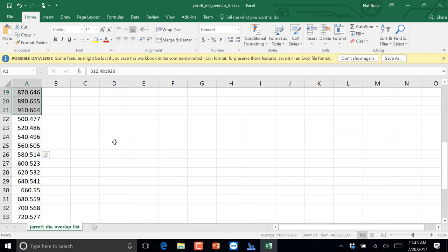One key thing when you're doing these overlapping approaches is to make sure that you don't sort the isolation window list, because then it's actually not going to work. That's a very common problem, because when you've done that, you could still demultiplex the data, but you've then reduced your sampling time for any given peak from 2 seconds to 4. This method is applicable for, I think, any instrument that can do DIA, so make sure your method editor doesn't sort this for you. I think an earlier version of the QE, very early, probably no one even has it anymore, used to sort it at one point, and you just have to be careful that it doesn't.